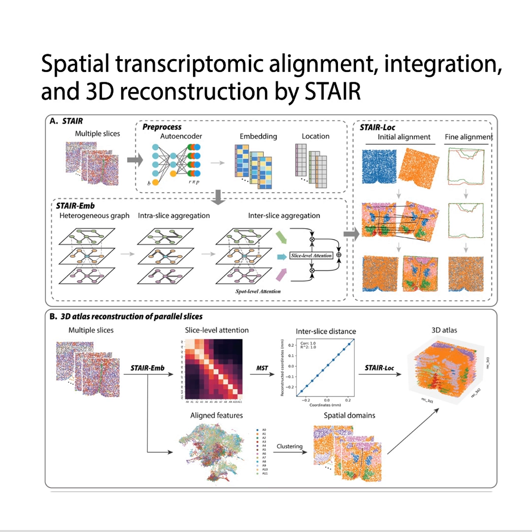Exactly. So STAIR has proven it can take molecular features, clean them, integrate them, and then use those relationships to perfectly order and position slices in 3D, entirely without guidance. That's the core of it, yes.